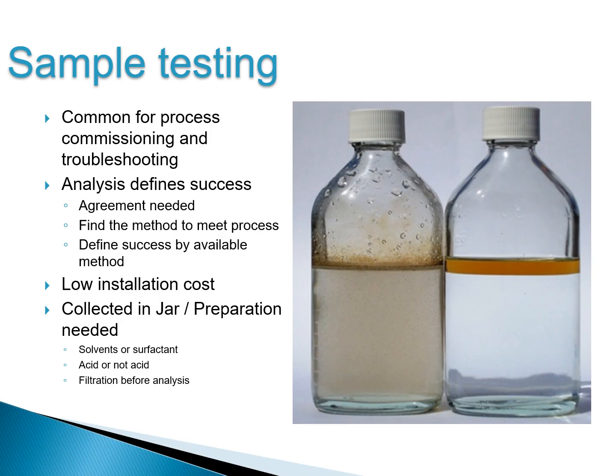However, the nature of the oil in that water can be one that doesn't allow hexane to extract it. There can be water soluble organics. There can be different things in that water phase that are or are not soluble within hexane. So we want to have a really easy way to prepare these samples. We want a way that meets the treatment technology capability as well as the process capabilities. So we're going to talk about ways of manipulating the samples here.